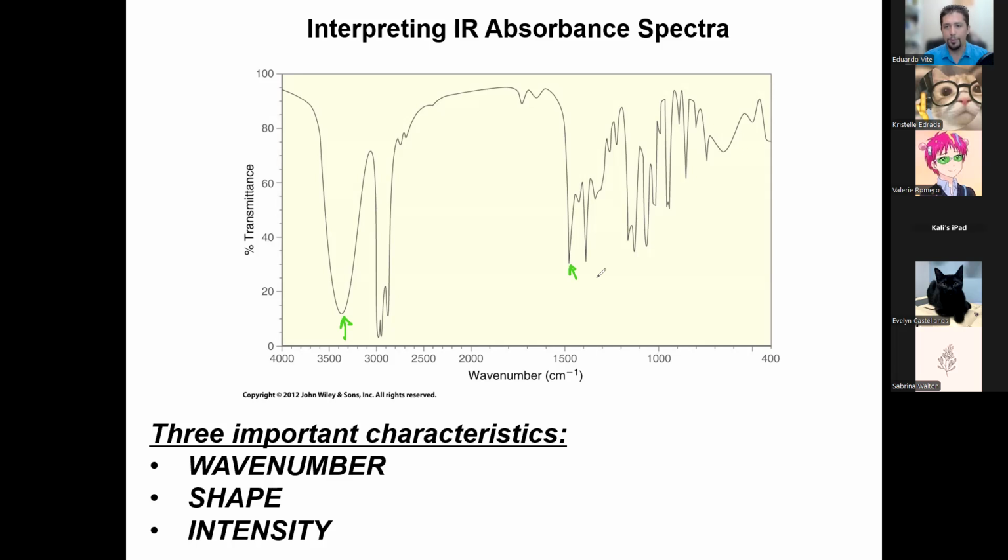Yep, 1500 roughly, right? As long as you can estimate reasonably, you can't look at that peak and tell me 2000. No, no, no, man. 2000 is way over here. That's nowhere near that. So you have to be reasonable, right? Estimates are okay, but be reasonable about it.